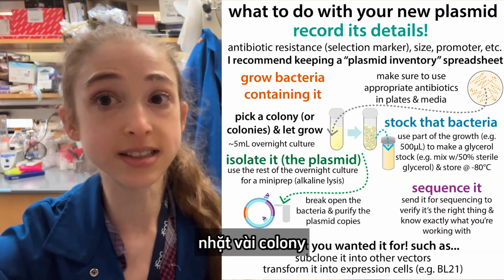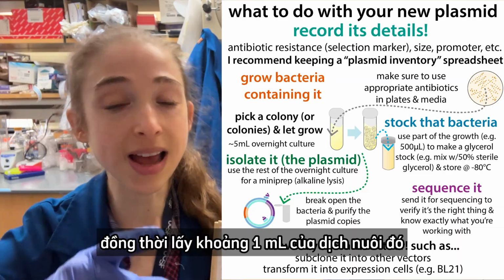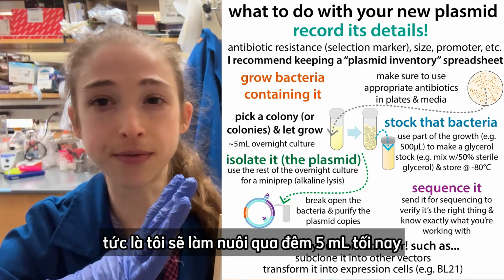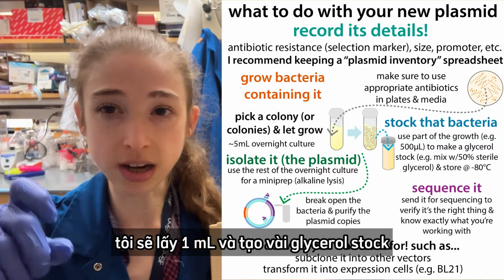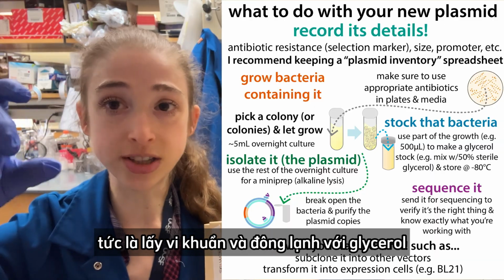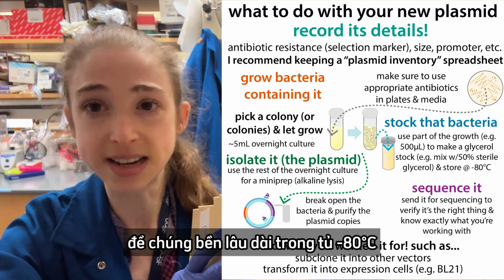I'm going to pick some colonies. I'm going to do an overnight culture, and I'm going to do another mini prep as well as take a mil of that culture. So I'll do a 5 mil overnight tonight. I'm going to take a mil of it and make a couple glycerol stocks of it. So basically take the bacteria and freeze them with some glycerol so that they'll be stable long term in the -80 freezer.